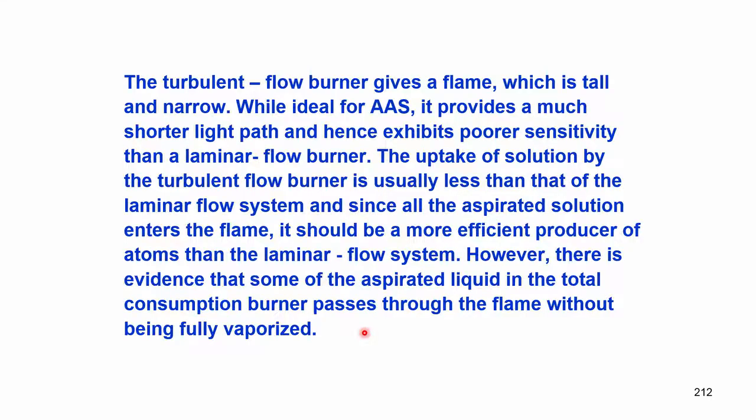So, there is evidence that some liquid does not get completely vaporized, and some of it may fall down, it may reduce the temperature because it has not vaporized. So, if you throw water on a flame, temperature gets reduced, that is the reason. But not much, especially whenever we are burning fuel gas along with air.